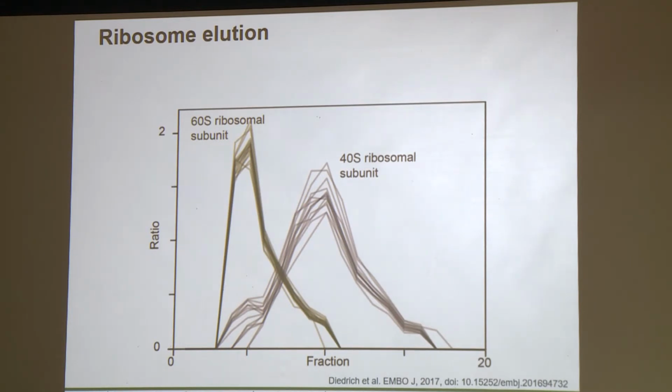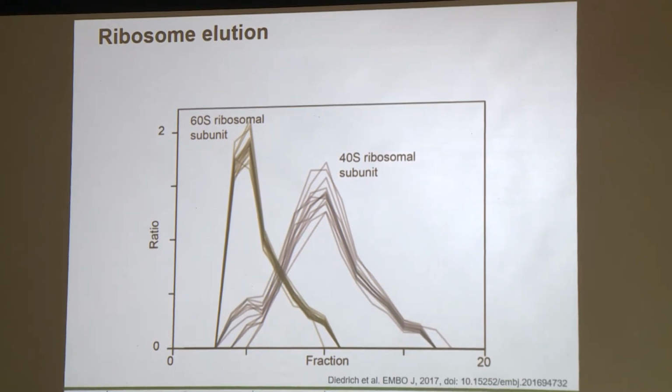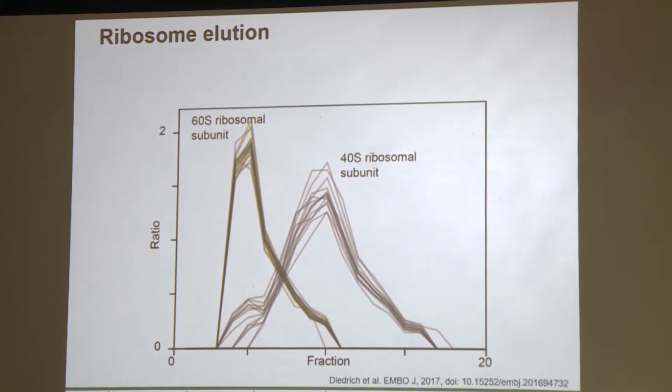These are very heavy experiments on the mass spec side, right? Because in total, we generated 56 fractions. So these are basically 56 mass spec runs you have to do for one single experiment. So it's a lot of mass spec time. But the data looks very nice.